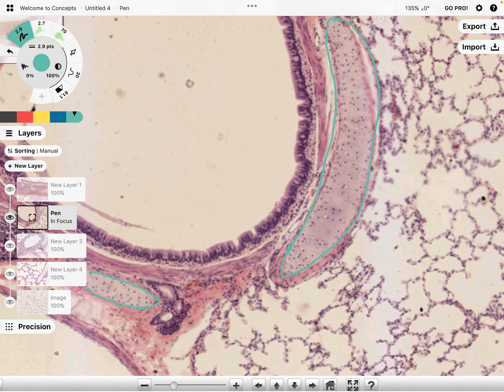but it's not. So one thing to point out, one of the definitive differences between the hyaline cartilage in the trachea versus in the bronchi is that it's irregular and it's discontinuous. So we don't have this C shape. We have these large structures of hyaline cartilage, but they're irregular shaped and they're also discontinuous, so they're not exactly connected to one another.